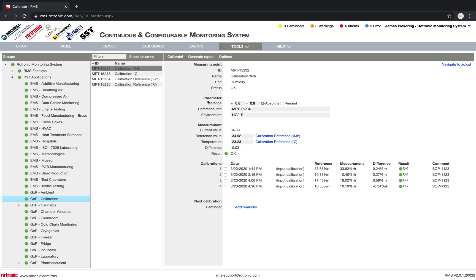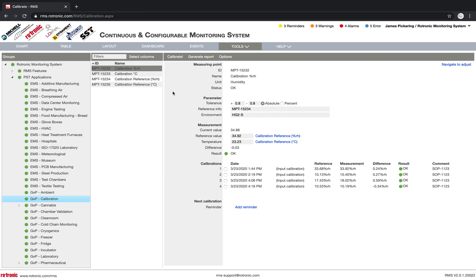Down here below, then I have my parameter where I define my tolerance. What tolerance do I have on the calibration? So this means what deviation can the instrument under test have from the reference instrument? So what is my reference? My reference is the MPT15234. And that's just on the side here. This is my reference, MPT15234.